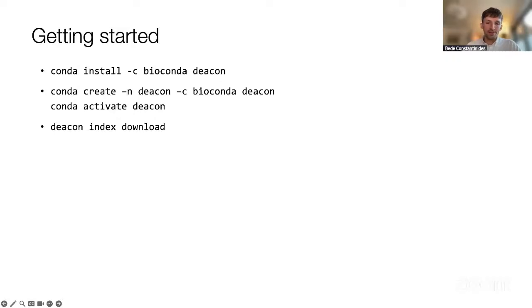because other tools have been developed for low complexity metagenomes, maybe for TB, and some of these other tools that I've shown here would achieve higher accuracy than Deacon in that context. But my argument is that if you do not know what you're sequencing, you should expect complexity, and you don't want to throw away bacterial genomes.